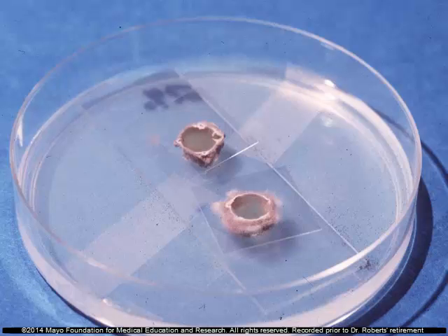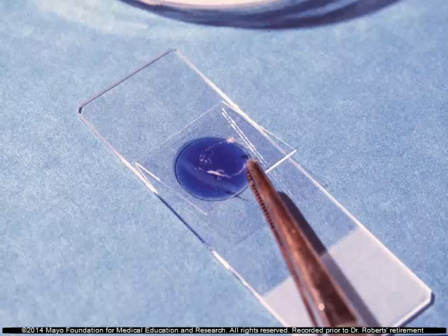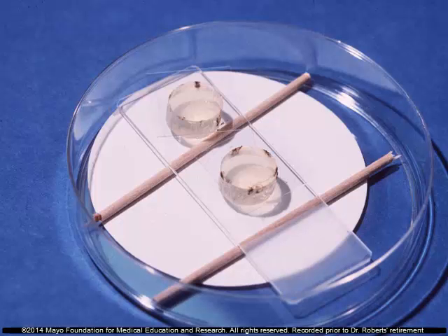Sometimes you happen to look at it too early so that you don't see things that you need to see, and that's why we have a second plug on there. You can go back and put a cover slip on top of that first plug and let it grow longer if you like to. Here's where you take the cover slip off and put it on a slide with a drop of lactophenol blue, and then take a look at it underneath the microscope.